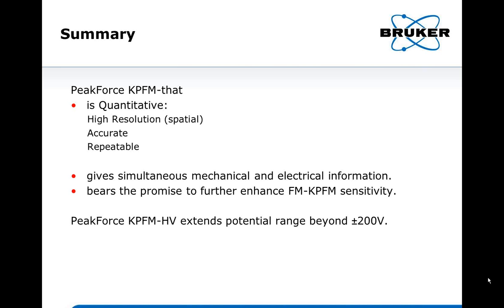Yes, the real signature of an artifact is a sudden change of the potential contrast when you change the lift height. Although, in the software you do not have to do that. You can just look at the tapping amplitude on the lift line to see whether it's close to the free air amplitude.